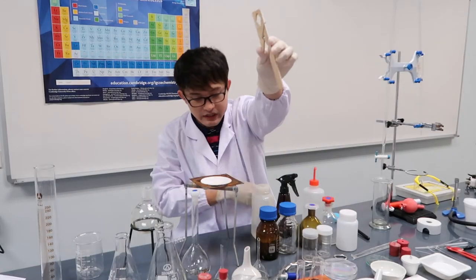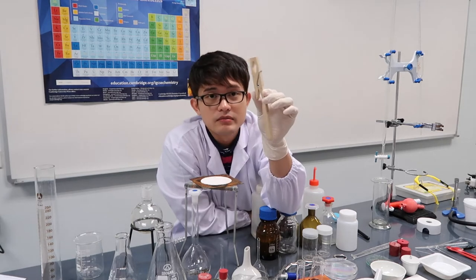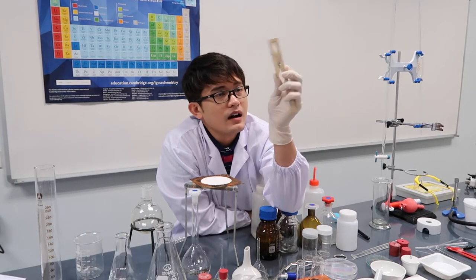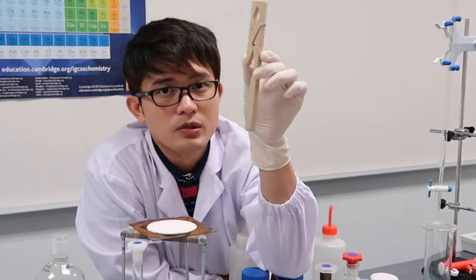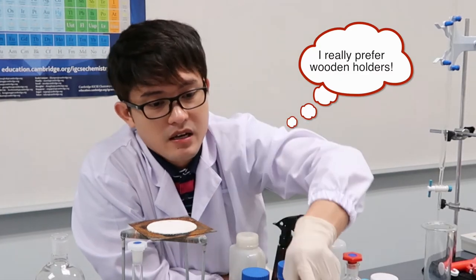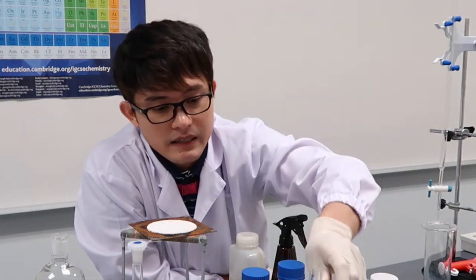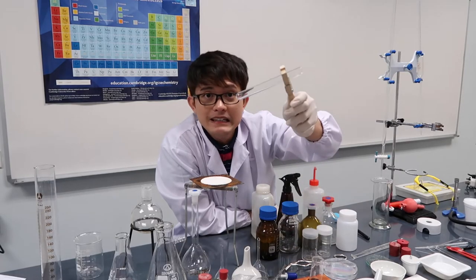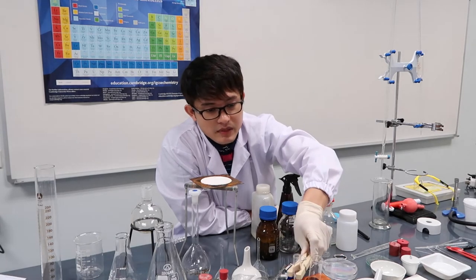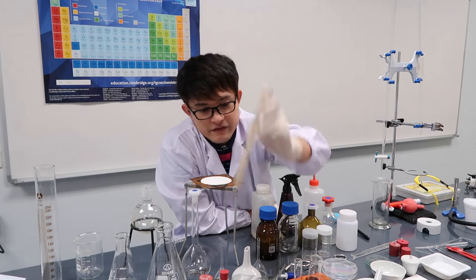This is a wooden test tube holder. There's also a metal test tube holder, but we prefer the wooden one because wood grips easily and doesn't conduct heat the way metal does, making it safer — even though wood can break more easily.